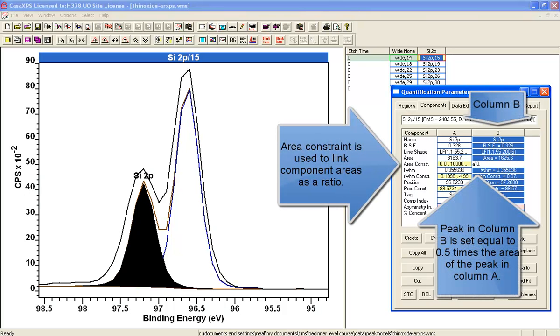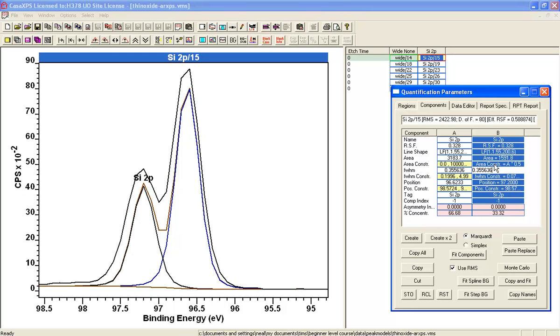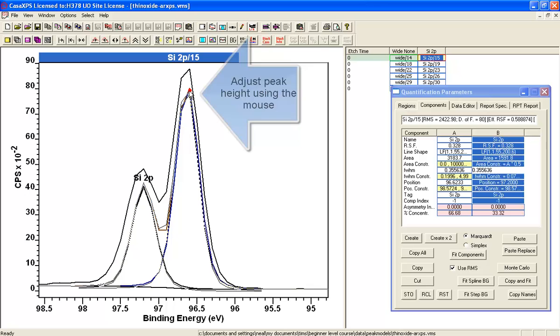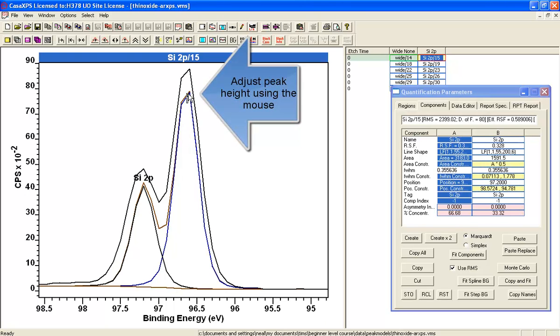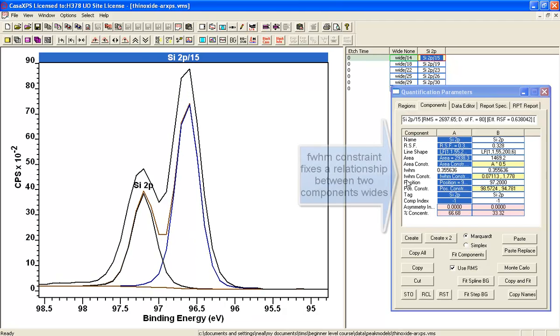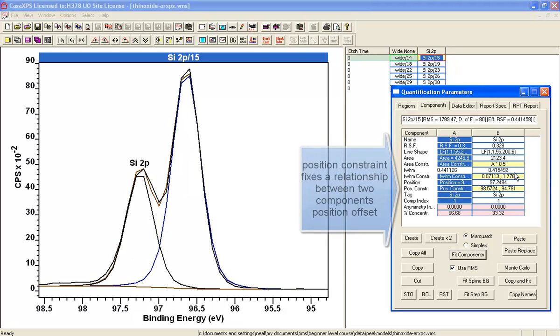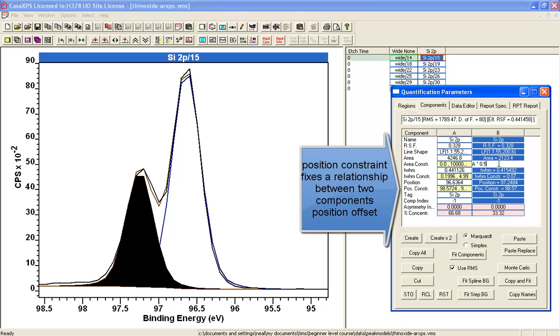By a factor of two. So if I divide the area of the first peak that's now in column A by two and I press return, I've now imposed a constraint in terms of area. So when I adjust the controlling peak, you can see that the area adjusts, but the relative position does not adjust, and nor does the full width at half maximum because these are allowed to move freely. So if I press fit, I now get a fit to the data based on using this relationship.